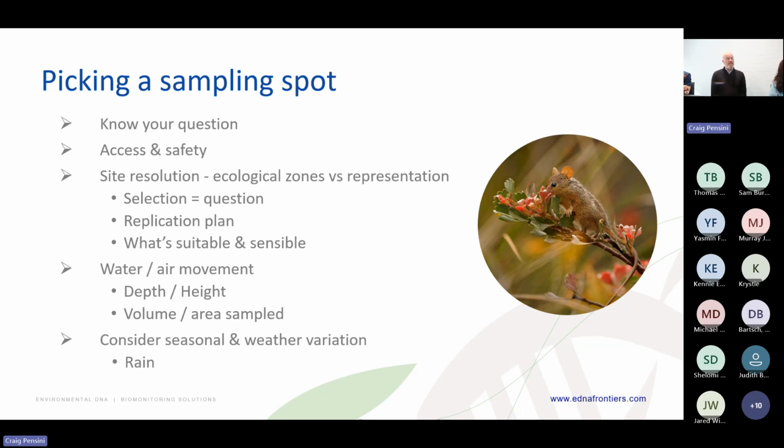The replication plan is that you've got a stochastic, molecular-number concept. Not everything's going to end up in one sample, and so biological replicates are super helpful. We do all of the technical replicates in the lab, so you don't need to worry about that. But at least 3, the gold standard is 6.